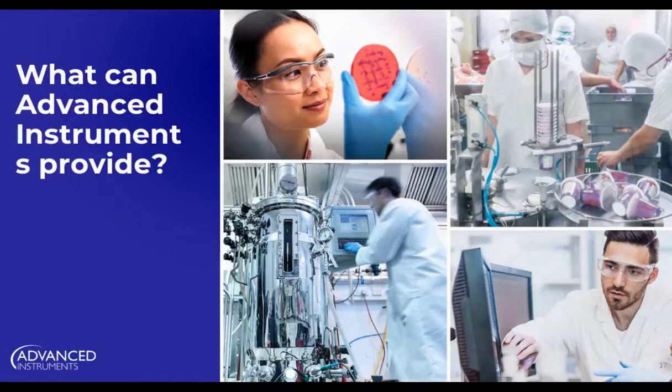Thank you so much for that report. We're certainly very excited about the data and the story that comes from that, and also to see where it leads us, whether it's into cell and gene therapy or advancements with purification processing. So one thing that I did want to provide is, we've talked a lot about osmolality testing, but the question is, how do we accomplish this?